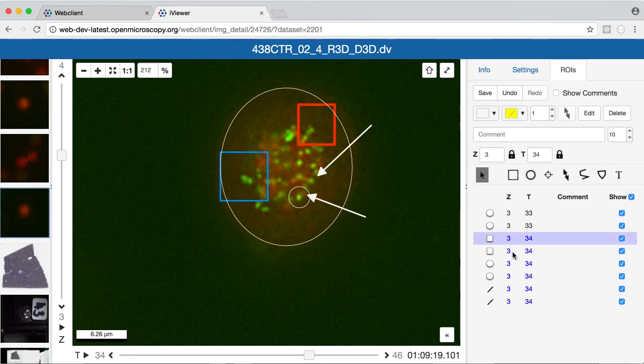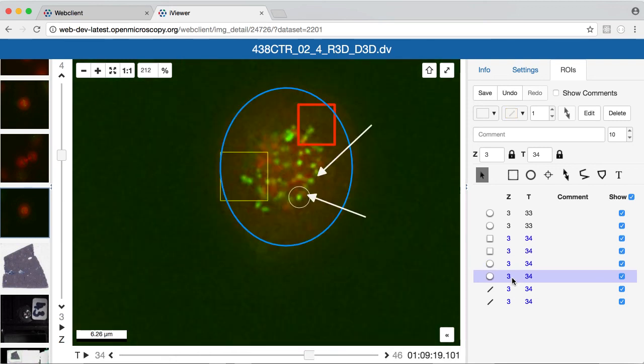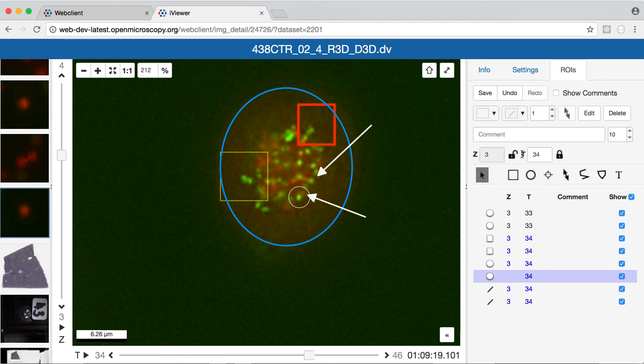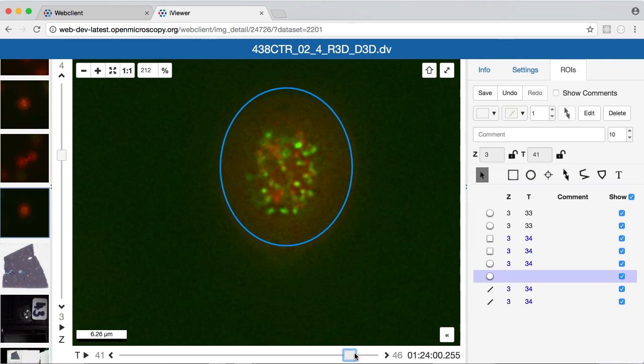And I can also, when I select these shapes, I'll be brought back to the plane on which they are. If I want to have the shapes applied across all planes, I can unlink the shape from the z and t index here, so now that will be available to me across all time points.